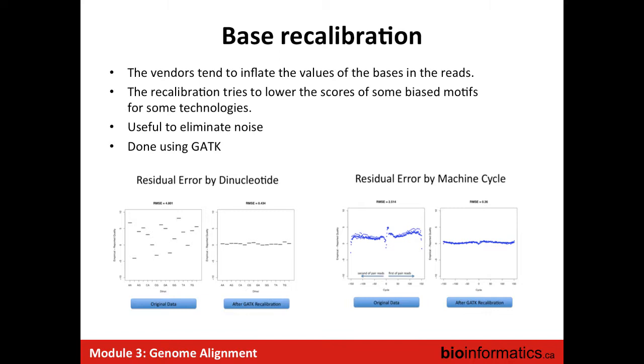Usually it's better to do it after mapping, but I'm not aware of a specific program that handles parallel sequence. Do you mean by that haplotypes or this kind of thing? Yes. So usually it's better, no, it depends on the reference.